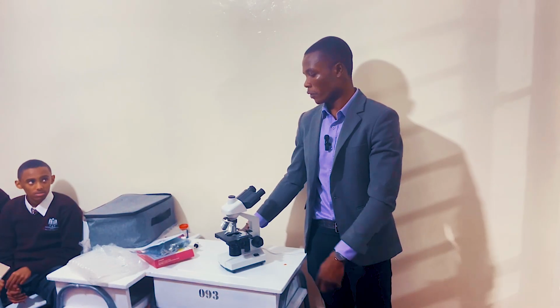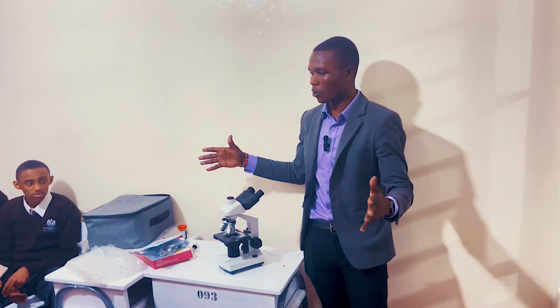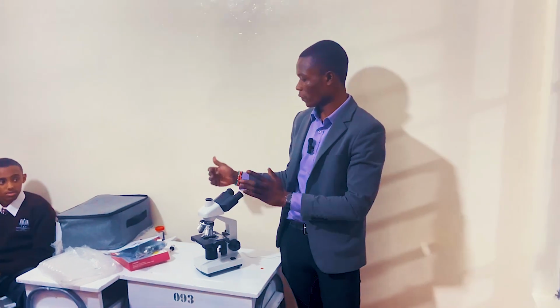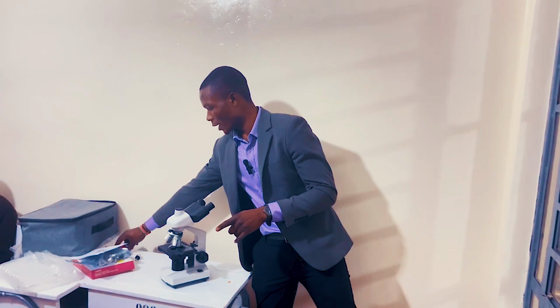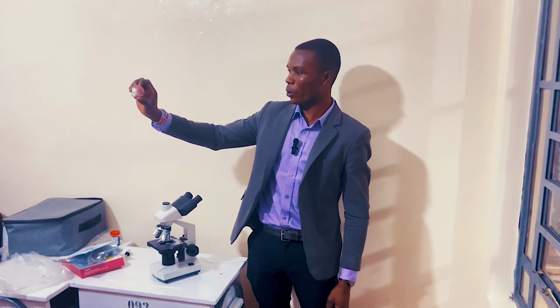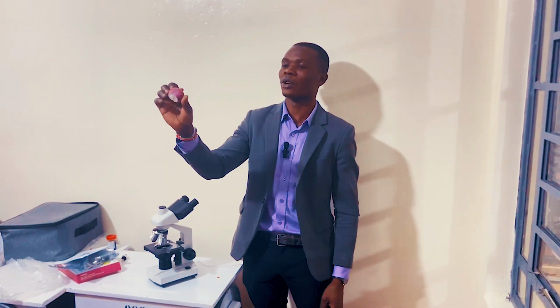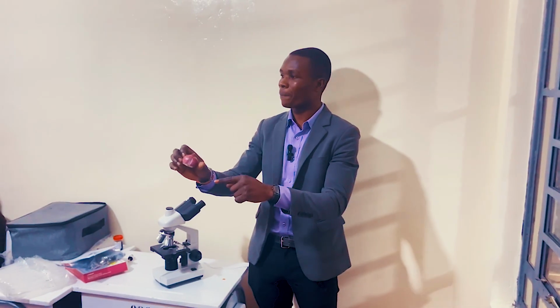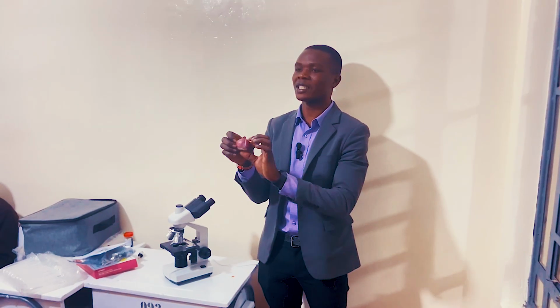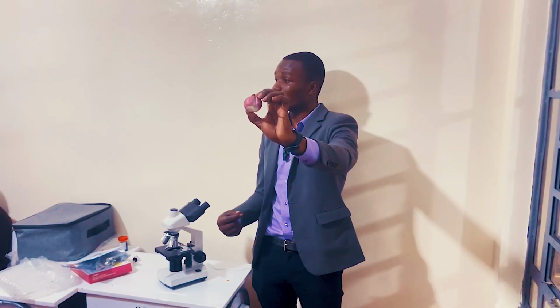Preparation of specimens to be viewed under the microscope. So we talked about some ways, or the procedure, of preparing a specimen. Anything you want to view under the microscope is a specimen. For example, here we have this one. This is an onion, right? When we are going to use the microscope to magnify it, we are not going to say it's an onion. We are now going to say it's a specimen. Are we together? So we can say this specimen Y, and we know it's an onion.